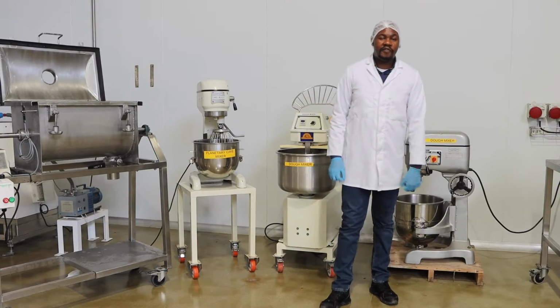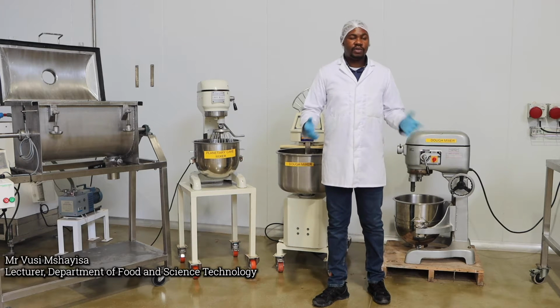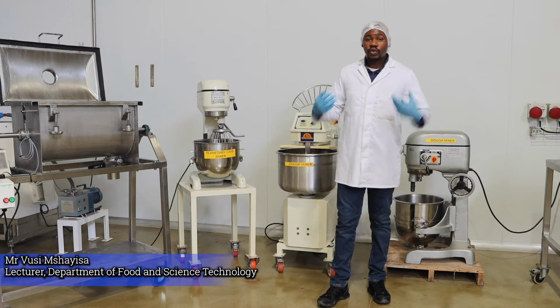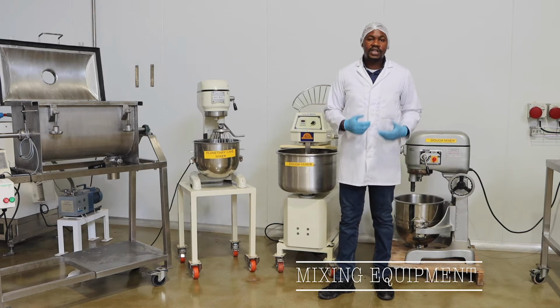Another episode of Food Technology 1, FOT150S. Here we're talking about the demonstrations for the equipment that you're going to use in your practicals. So today we're going to be talking about mixing ingredients, or mixing equipment.